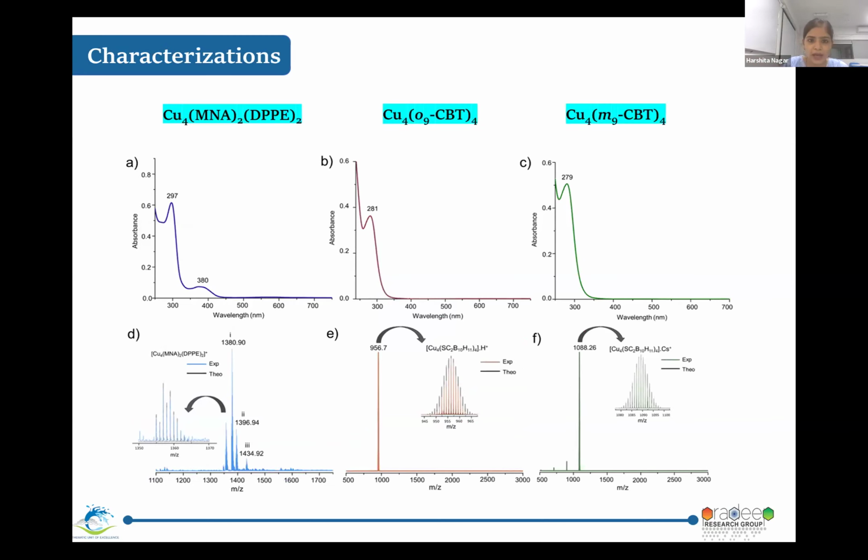Now coming to the work which we have done. We started with three copper nanoclusters with four nuclearity. All these nanoclusters are protected with different types of ligands. These nanoclusters were synthesized and well characterized in our lab by our seniors, and their structures are also determined. But since it was our first work on electron diffraction, we started with the small nuclearity clusters.